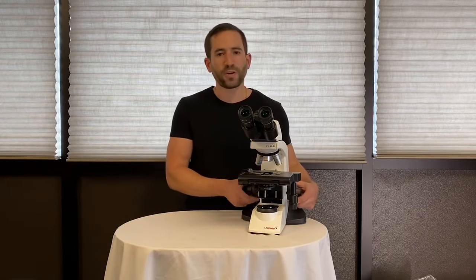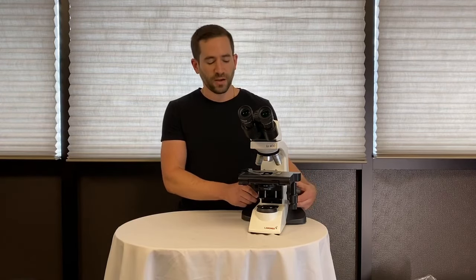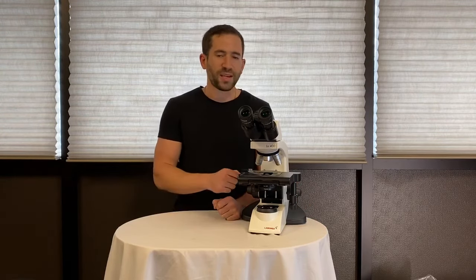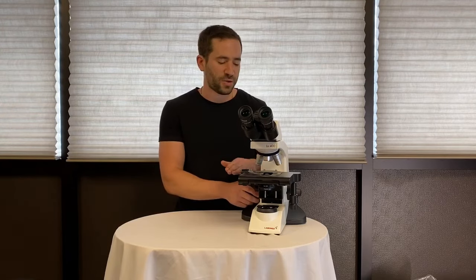It offers coarse and fine focus adjustments on both sides of the microscope, and the internal stops are preset by the factory so a student cannot tamper and adjust the stage height or tension.